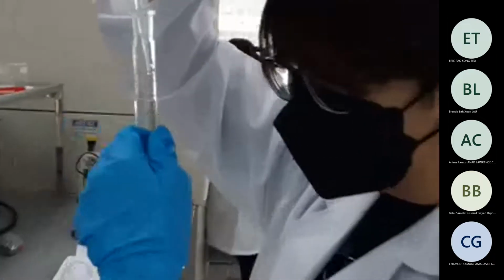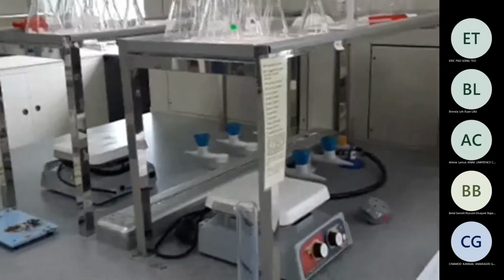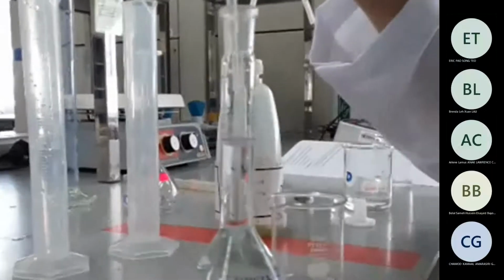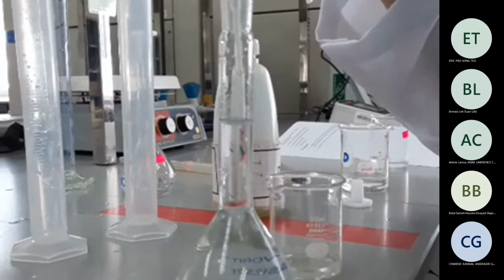Yeah, she's adding water drop by drop. To make sure it is better to put it on the table so that you get a perfect level. Otherwise, you keep it in your hand and don't put this here. It's so precarious. Until the meniscus level touches it. Yeah, meniscus only that.